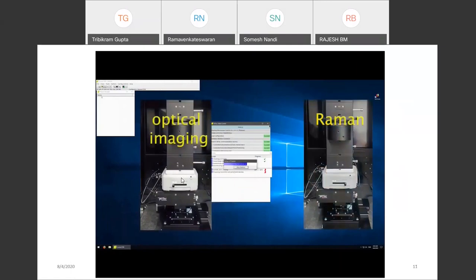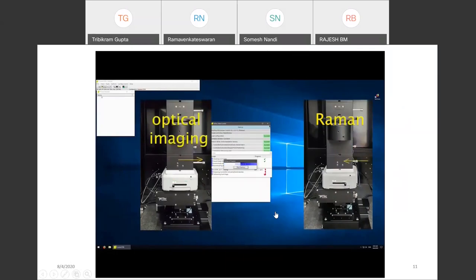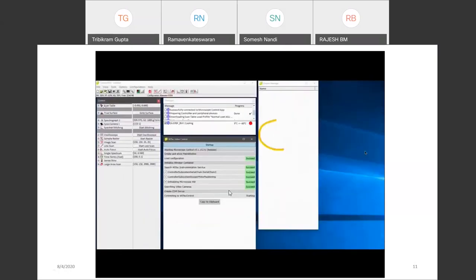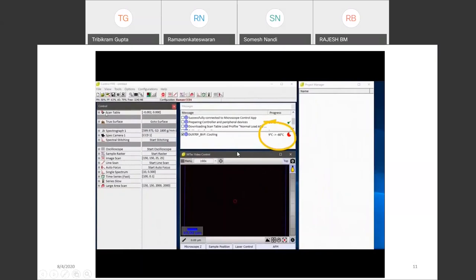Now we can look at the operators. There is a knob: if you turn it towards the left side, that is the bright focus mode, which allows the bright light to fall on the sample. If you turn towards the right side, it allows the laser light to fall on the sample. The detector — the charge coupled device — has to be cooled down to minus 60 degrees Celsius, and until that we need to wait.